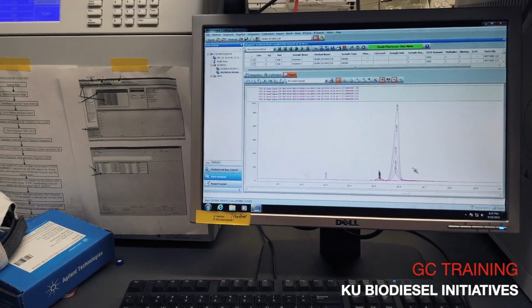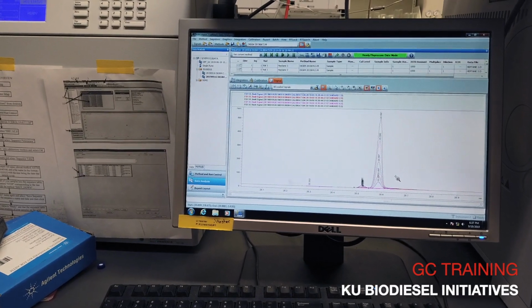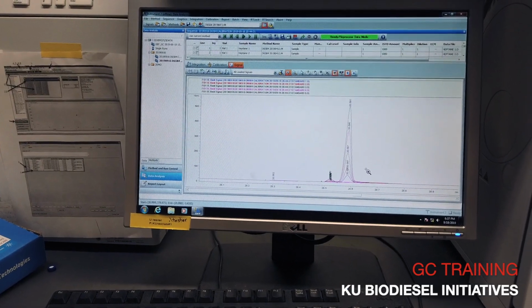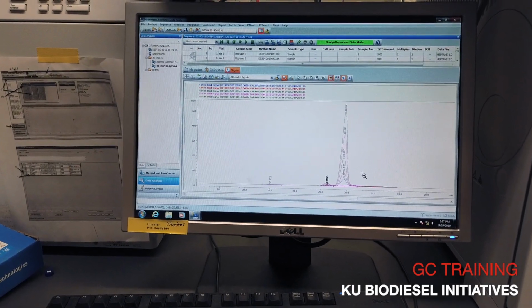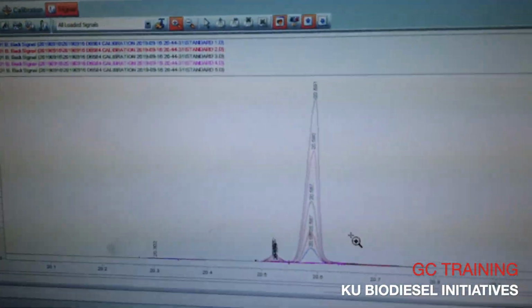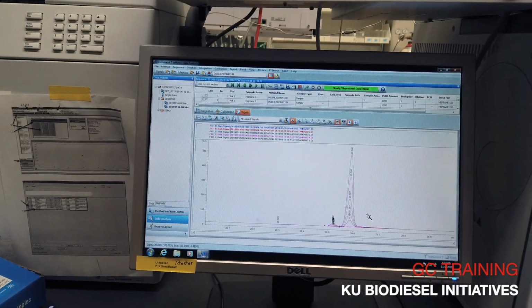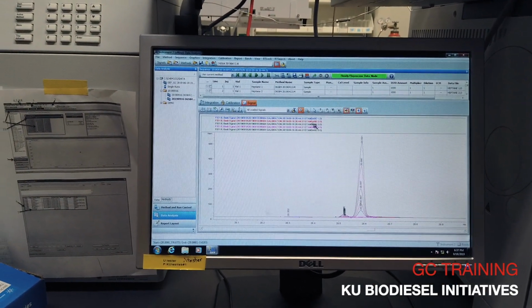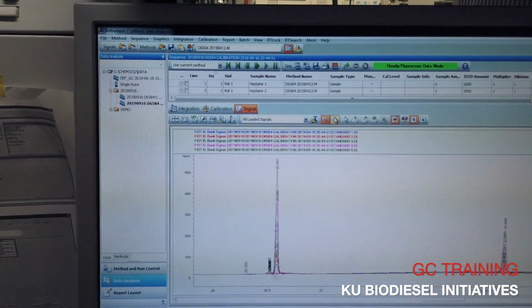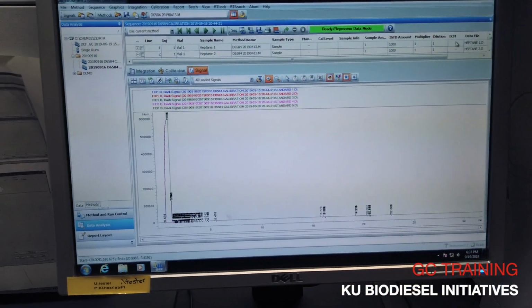That's not going to happen most often because you're going to have a really highly reacted sample. And let's say you distill it even after that, then you're not even going to have any dis or tris. So, for instance, this one right here is the tris, so it looks like it's possible that it'll work. Now we're going to have to just do the work to get it done.